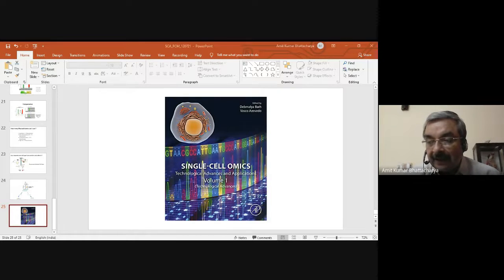The algorithm looks at each point in the image, and it identifies using a profile searching method: in this particular point, do I have autofluorescence by its profile, or do I have the signal from the first dye or the second dye?